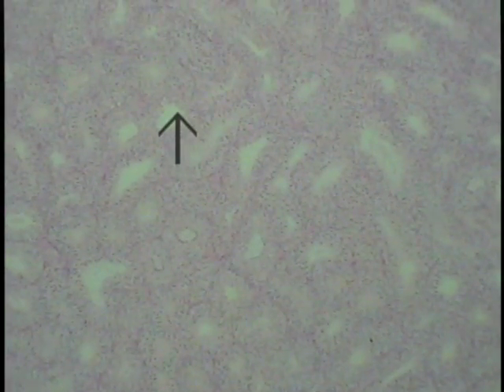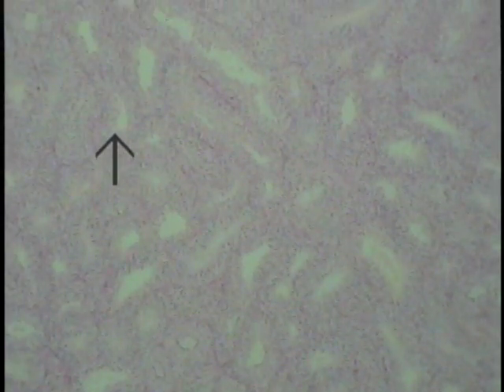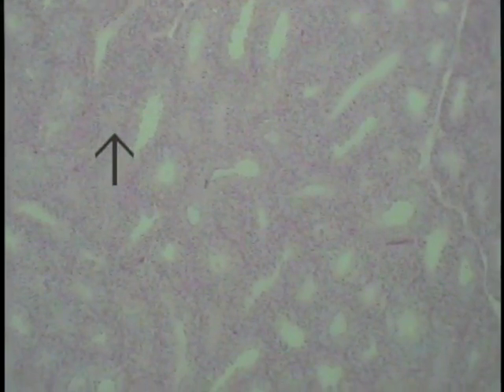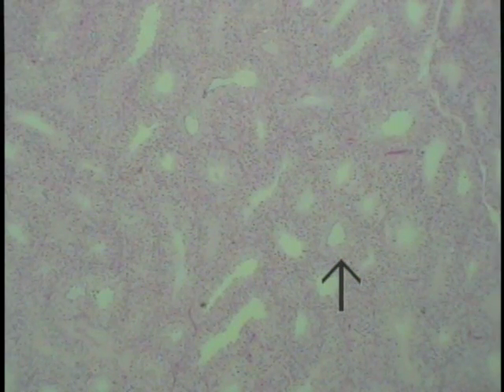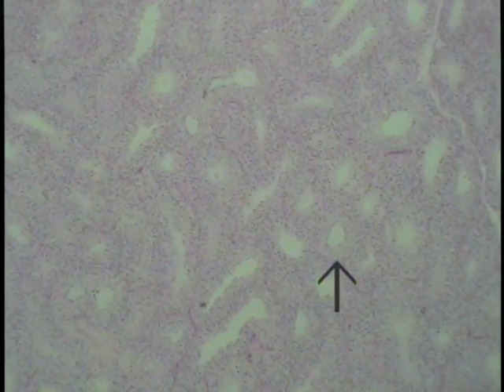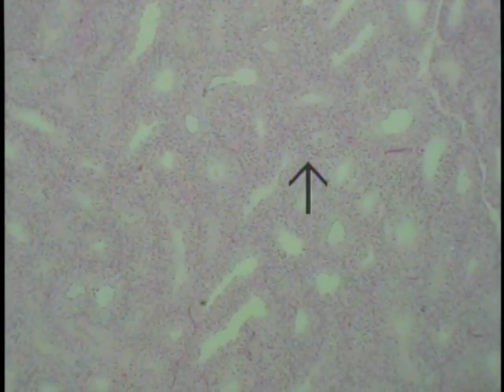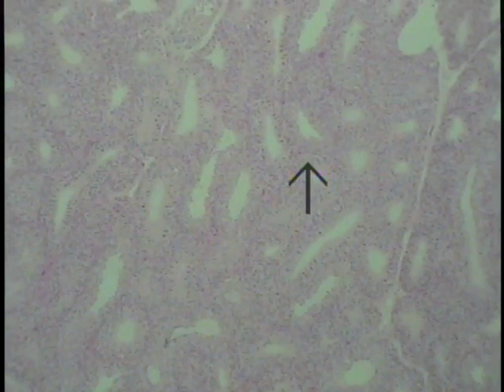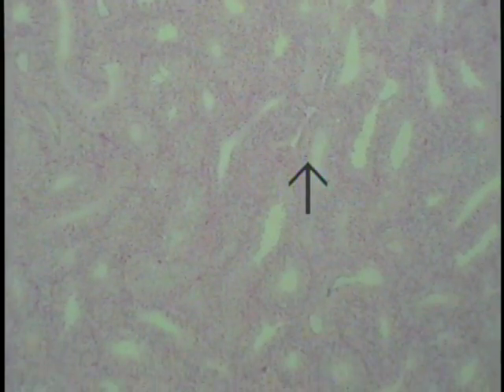Each one of these closely packed structures is an example of a seminiferous tubule. The testis consists of many such tubules filling the entire field of view. The interstitial tissue lies between the seminiferous tubules and separates them — this is where the Leydig cells, or interstitial cells, will be found. These cells, as you will recall, produce the male sex steroid testosterone.